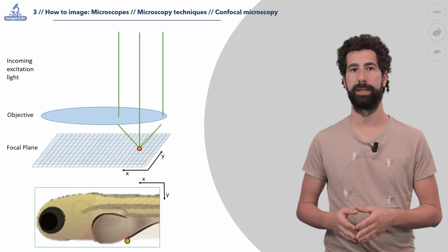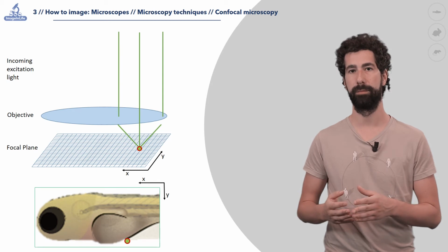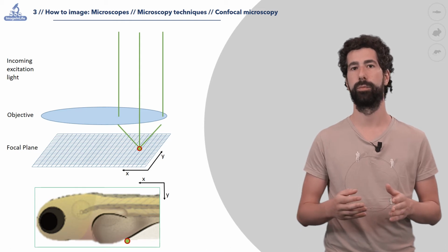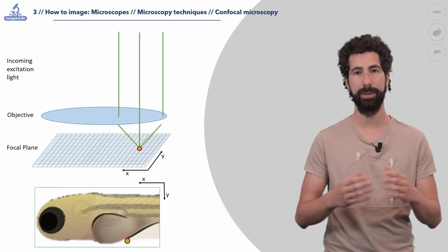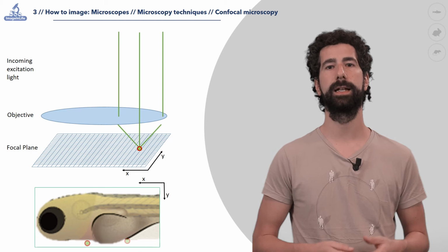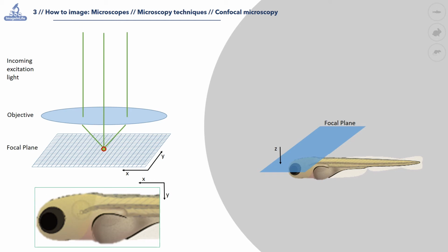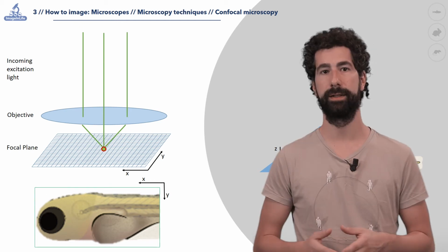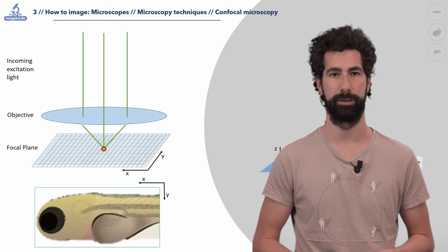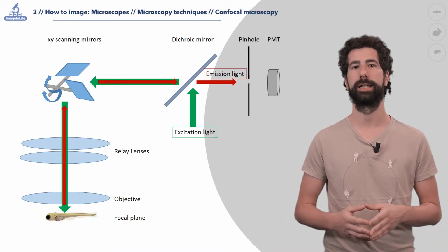We can then repeat this operation with various angles, and in this way cover the entire field of view. For every exposure time of the detector, we will record one single point. As the angle applied to the excitation beam maps the position of the excited point in the plane XY, we can later reconstruct the position of each point and therefore create the image of the current section of the sample. After the imaging of a slice, we can physically translate the specimen in the depth direction, which is Z, and start the recording of a new section. The images generated in this way then form the Z-stack, and they are mapping the depth information of the sample structures.